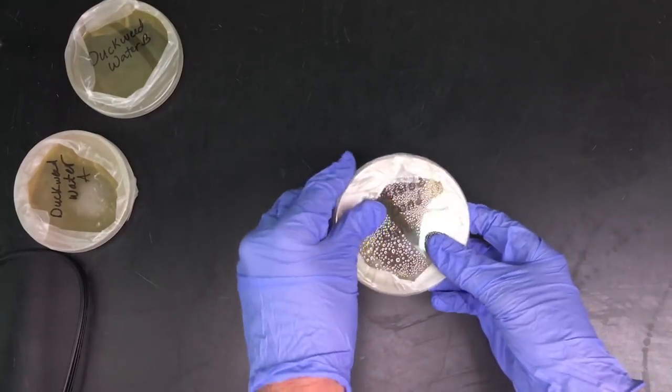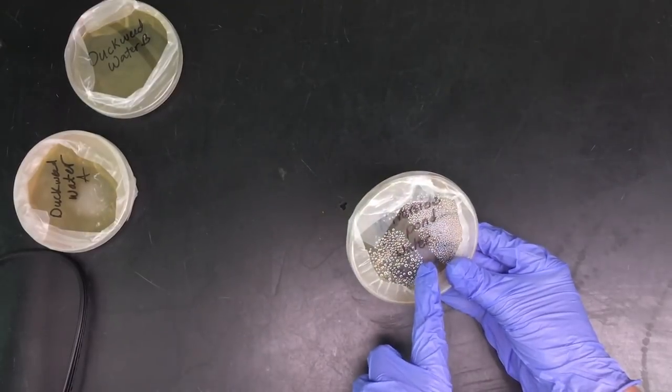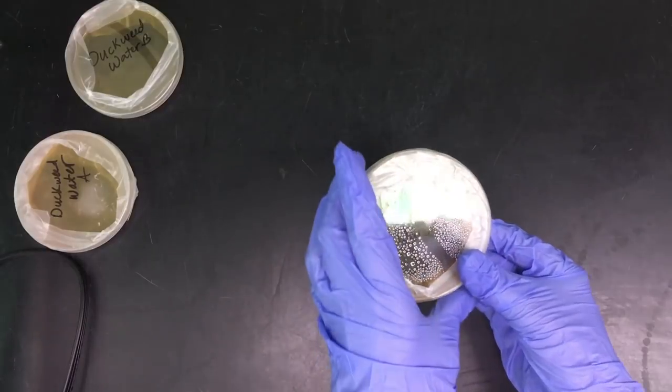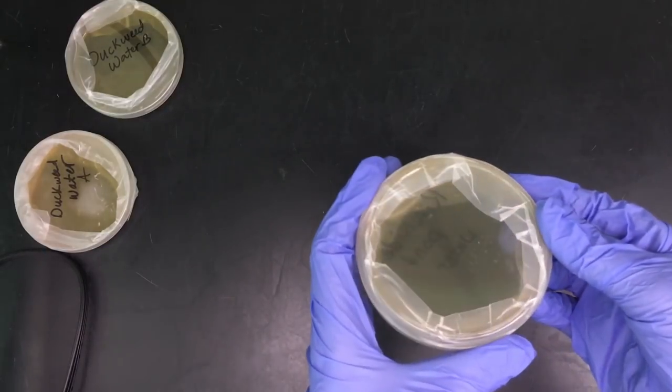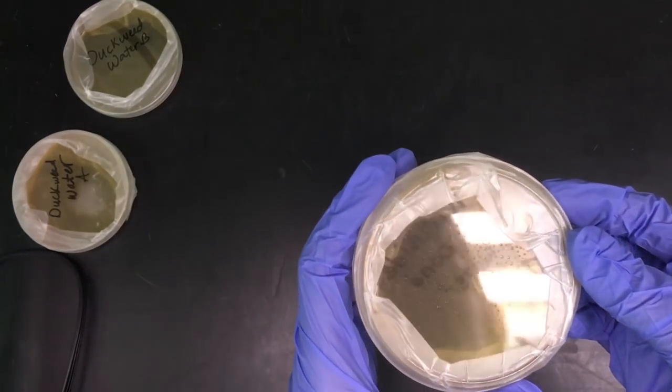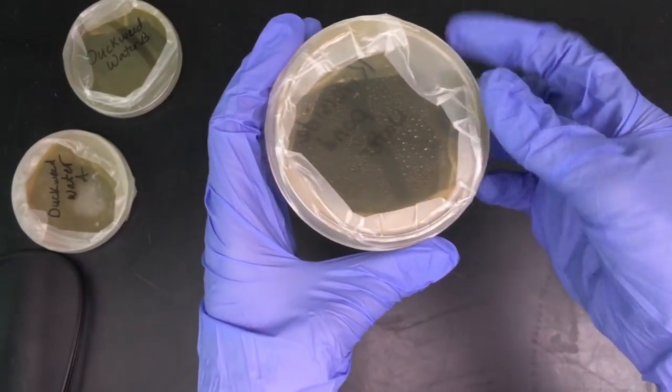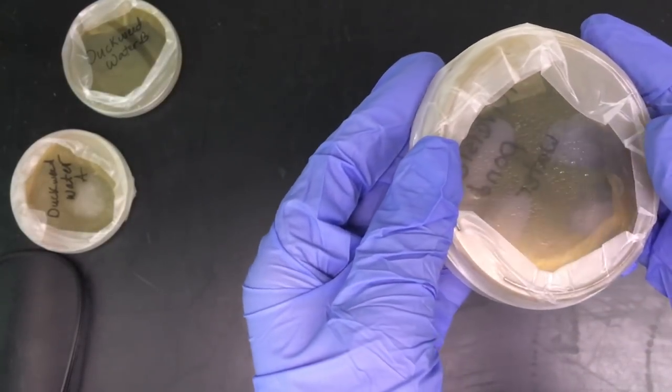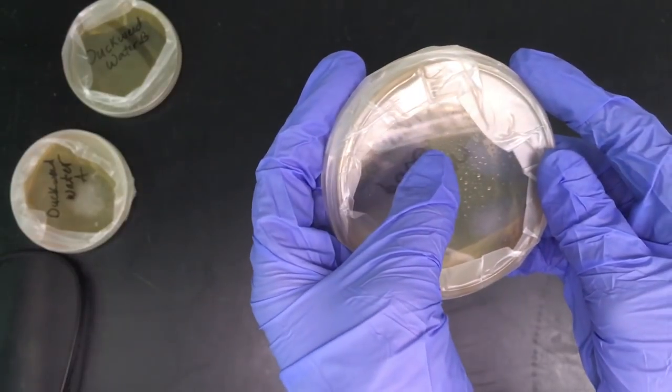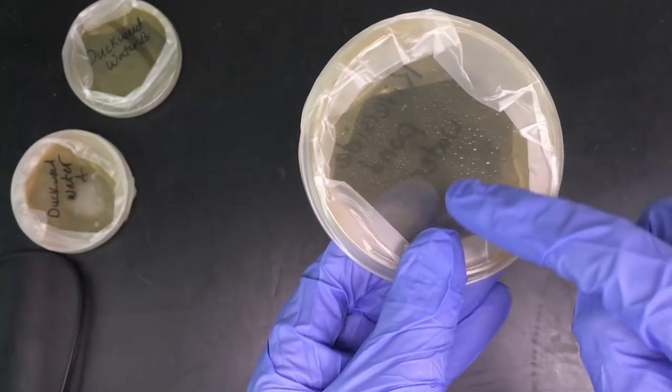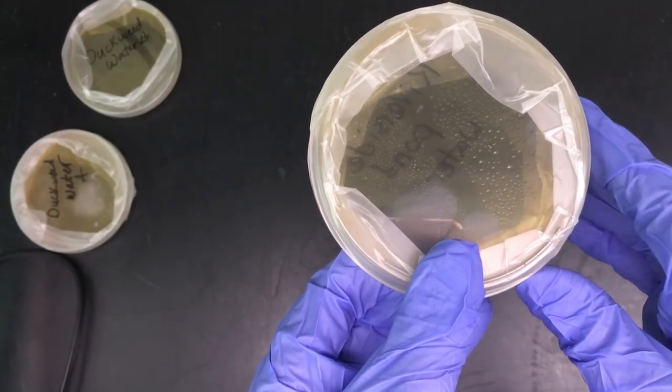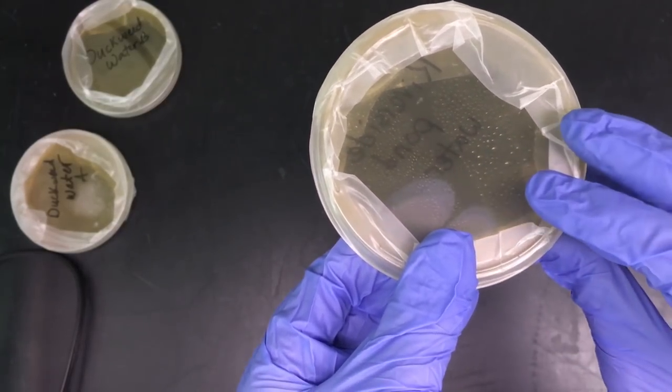So the next one here is riverside pond water. This pond water was also from reclaimed water, so treated wastewater. And it looks to be positive for one, so right there has one colony. Again probably from a mammal living nearby in the waste washing in.